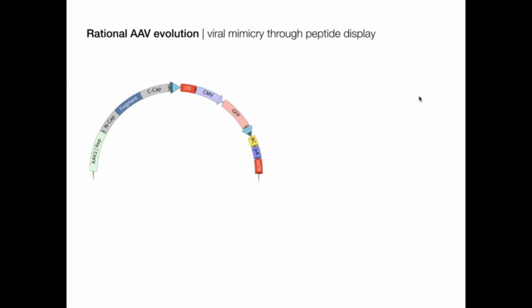To do this, we have a new method of sequencing based on a Cre recombinase. By adding Cre recombinase, we can cut out the ITR, CMV, GFP part and move the barcode closer to the fragment.